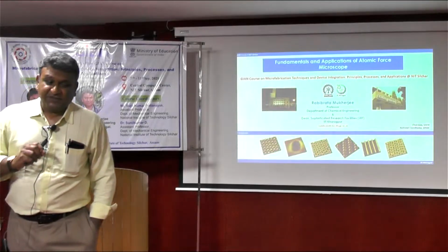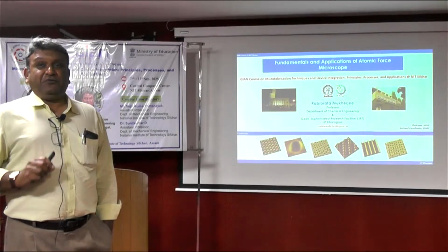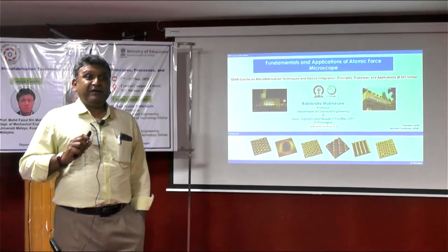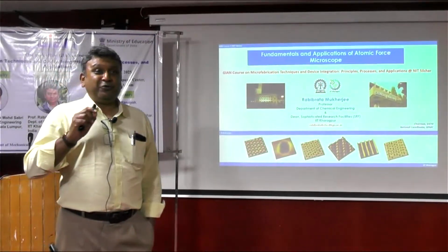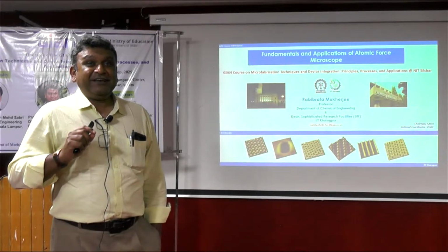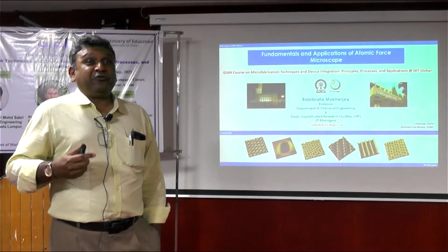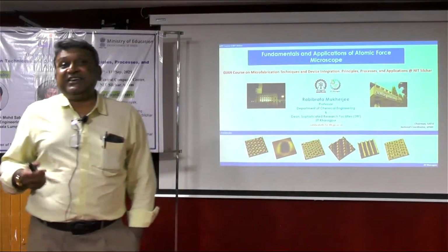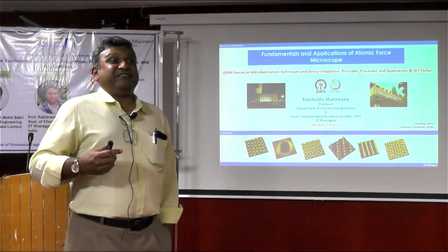So what I'm first going to talk about is the atomic force microscope. How many of you have heard the name atomic force microscope? Okay, fine. So you already learned something new, a new name. Microscope, all of you know, right? So since you are talking about microfabrication, nano and everything, and ultimately we are all humans, so seeing is believing, therefore we always need a microscope.